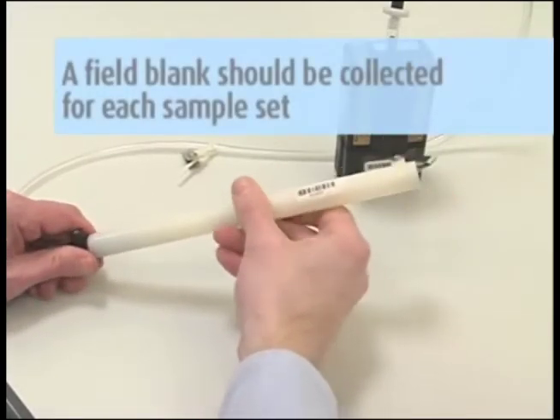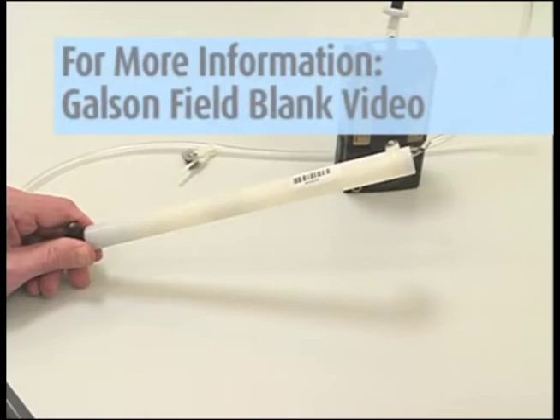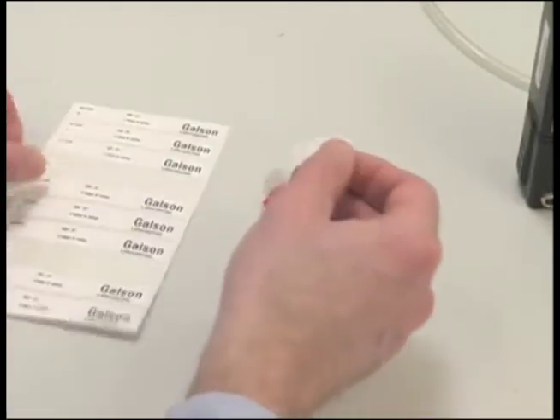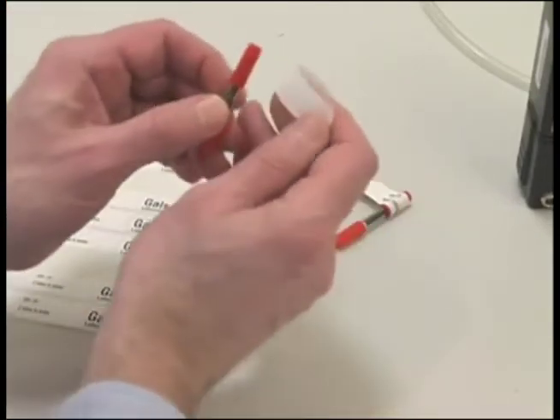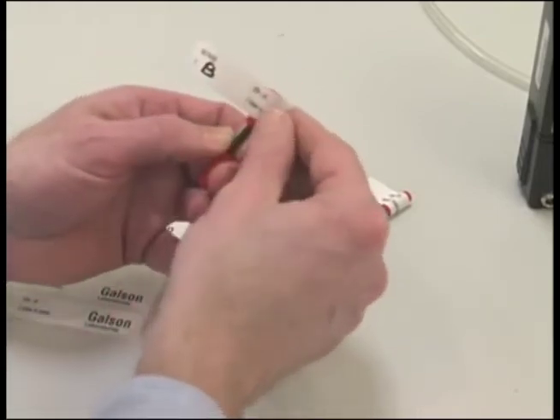A field blank should be collected for each sample set and should accompany the monitor during all periods except actual sampling. For more detailed information, watch the Galson Field Blanks instructional video. After sampling is completed, turn off the pump, remove the tube cover, remove the sorbent tubes, and immediately seal the tubes on both ends with the red caps provided.